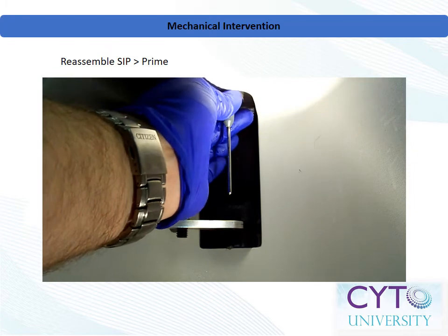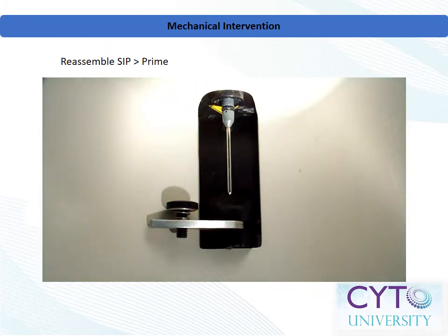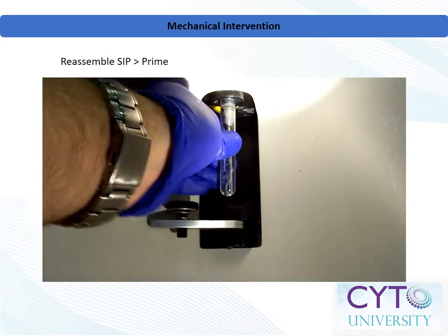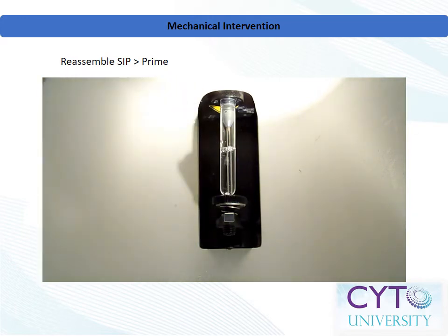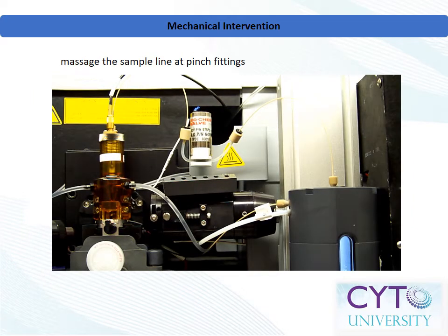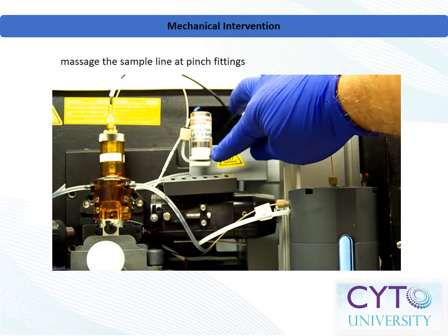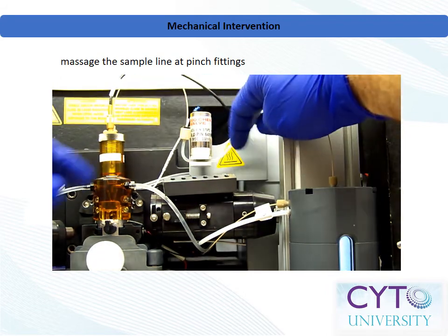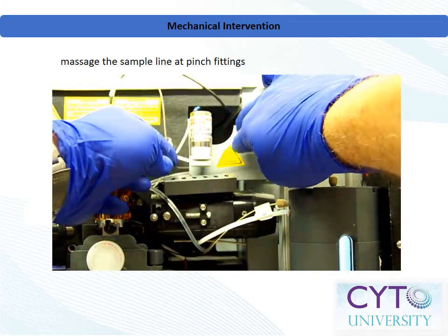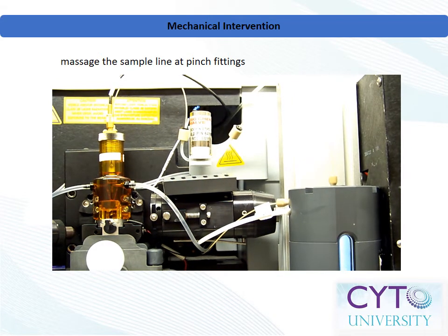At this point, you will want to prime the instrument to remove air from the flow cell. On some systems, the entire sample injection line can be replaced in the event of a major clogging event. In this example, sample delivery is controlled by a pinch valve, which may be a point of accumulation for clogs. Prior to replacing the entire line, consider massaging the tubing at the pinch valve in order to release the clog.